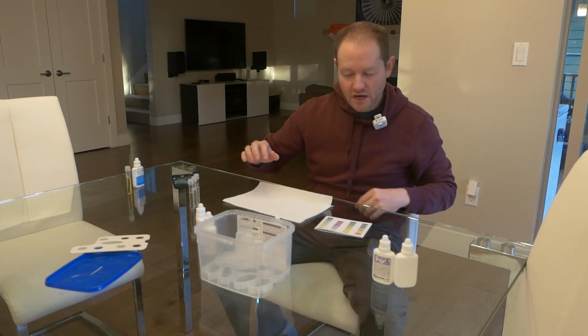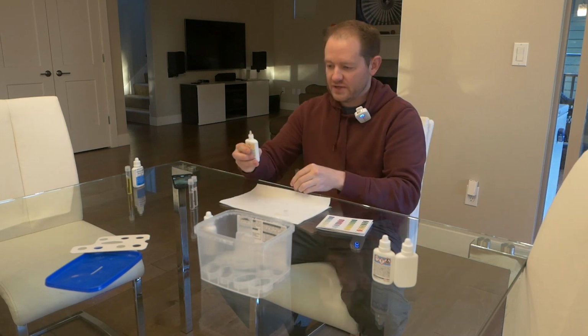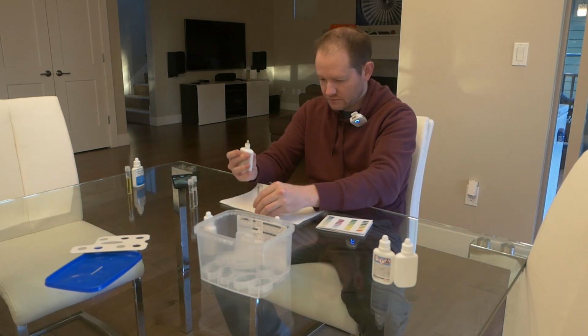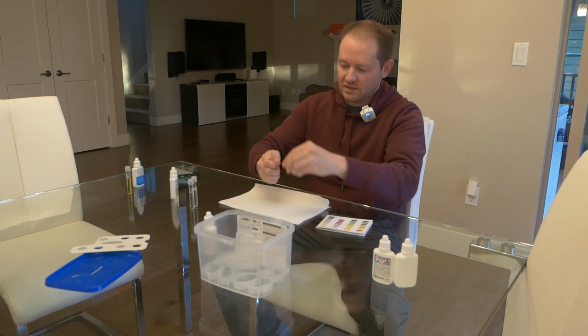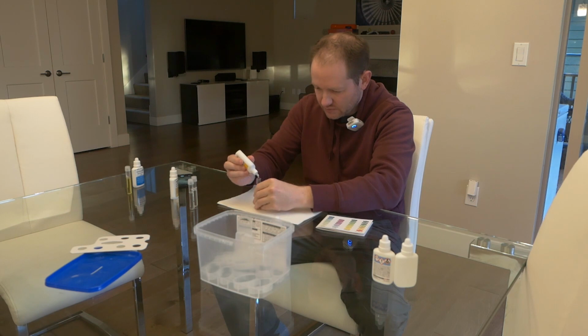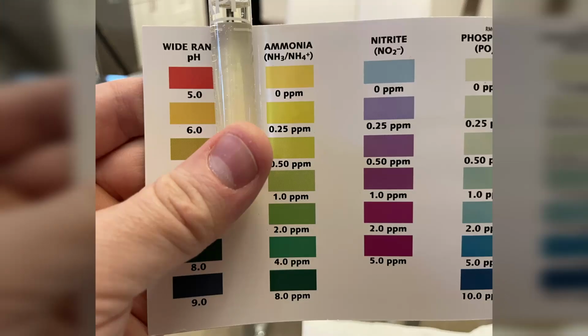Next, I'll test our ammonia, which is hopefully going to be 0. First, add 8 drops from bottle 1. Then we'll add another 8 drops from bottle 2. And that is indeed looking like 0. So ideal on that one.